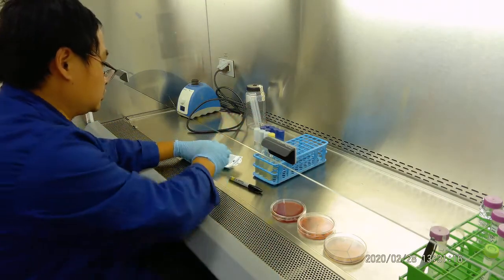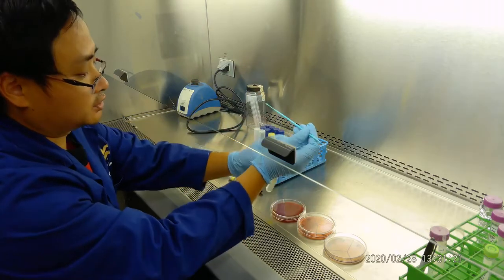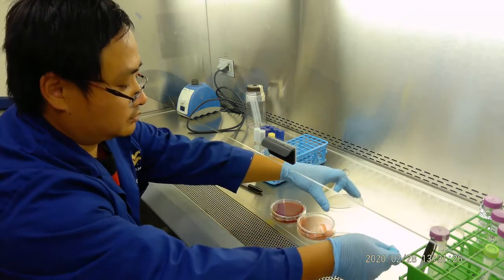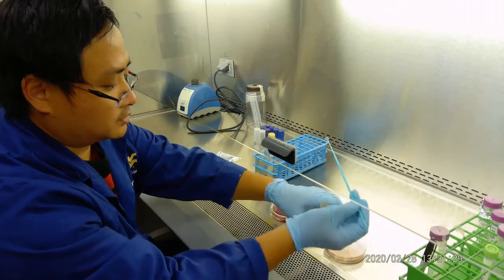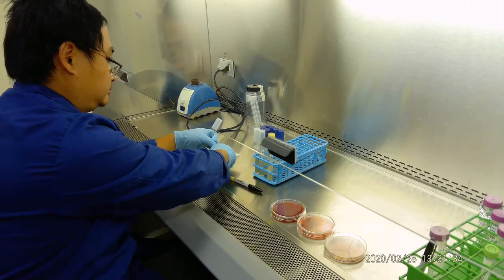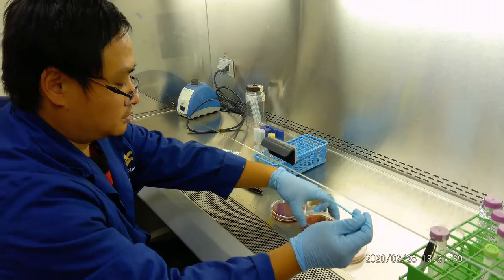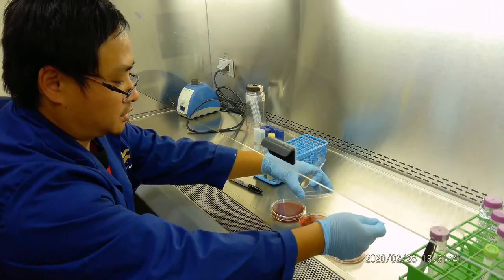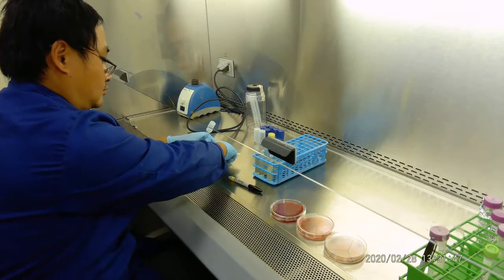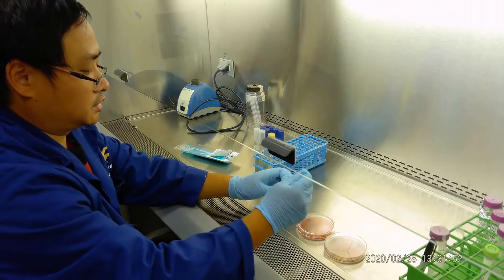Then the second one we're going to do is for E. coli. So we do the same thing. We streak E. coli there.